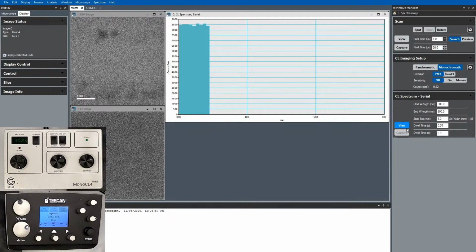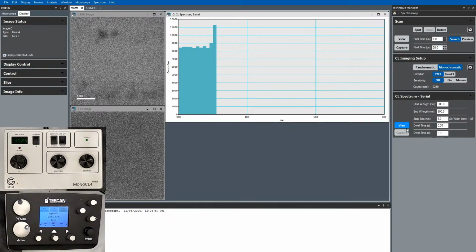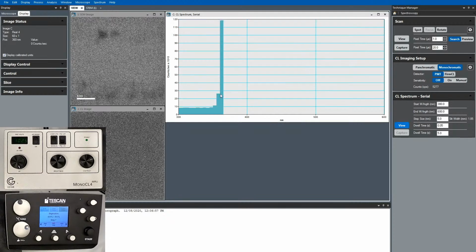Hang on 1 second. Okay, here we are back at 365.